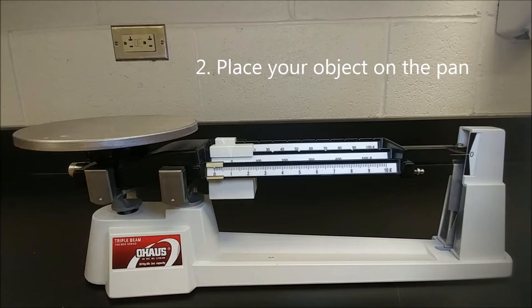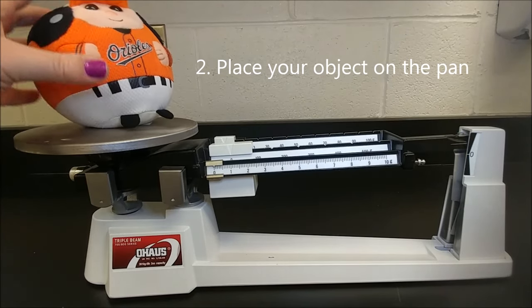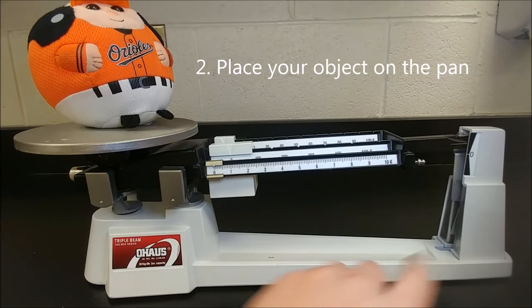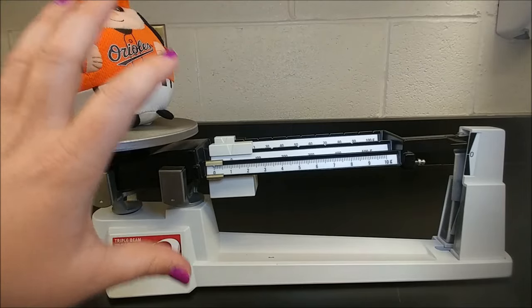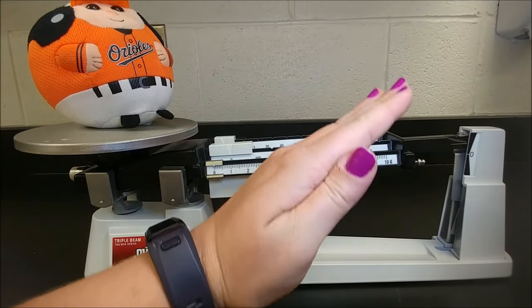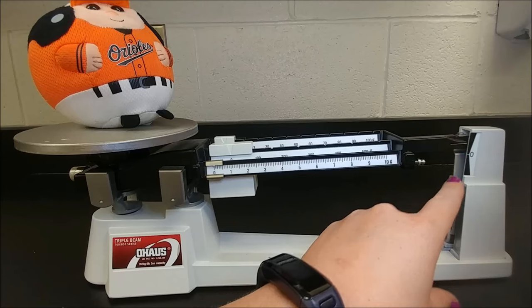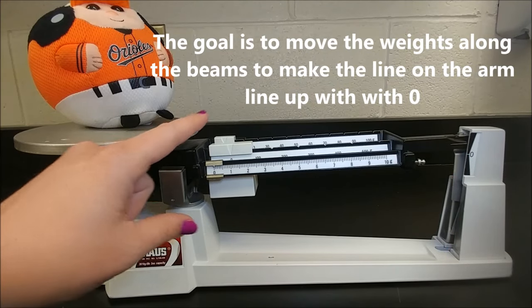When I place the Oriole bird on there, the arm jumps up. This is because there's more mass now on this end, which causes the arm to move up. So I have to get this line to move down. We do that by moving these weights on the bars.